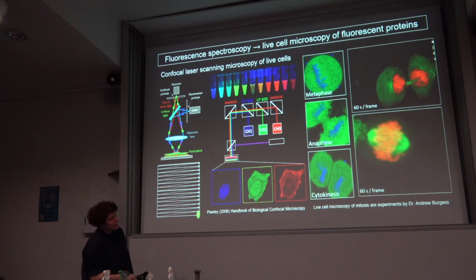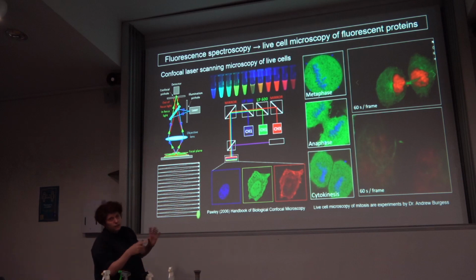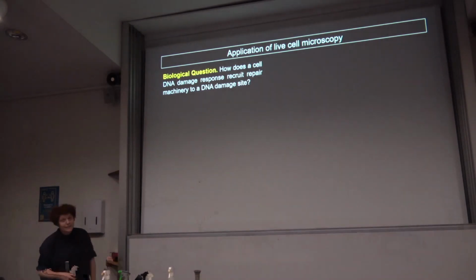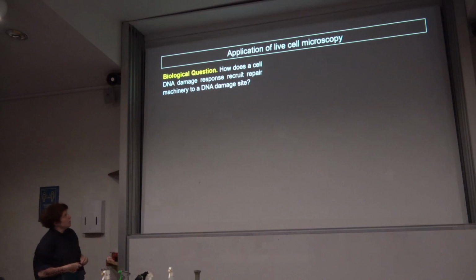And so here's another example. You can see the mitotic spindle, and then the cell divides into two. So just by labeling the different components of the cell, like the DNA that records the genome localization, and then the green fluorescent protein just is an inert protein showing you the cell plasma membrane, you can observe how, for example, DNA is dividing with quite high temporal resolution. So this is an application of this technology that's coupling the green fluorescent protein with laser scanning microscopy.